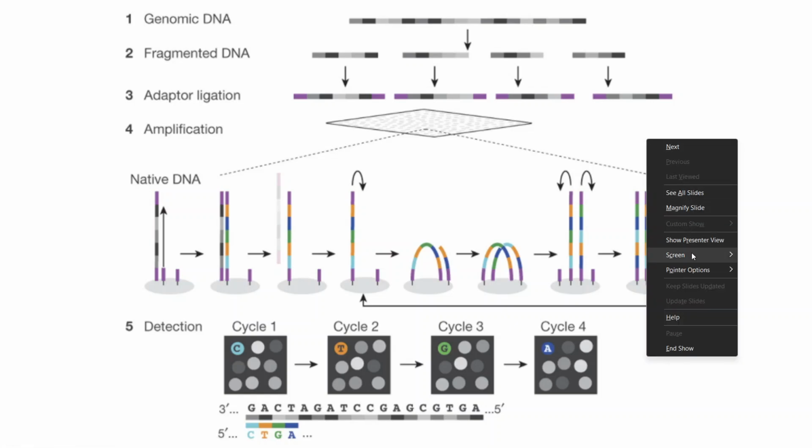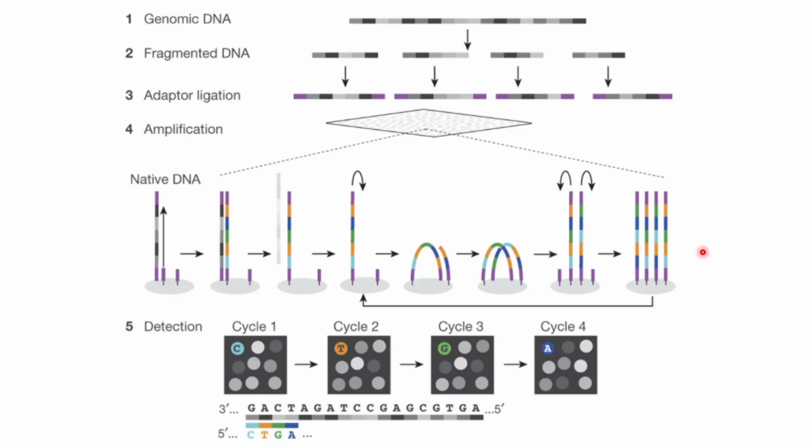As you all know, earlier sequencing was basically done with the help of Sanger sequencing, and next generation sequencing is done in the process of Illumina, and nowadays nanopore sequencing to completely read a whole genome is also being done. However, in this particular video, we will be discussing how sequencing platforms like Illumina work. Even nowadays, most of the time Illumina sequencing is one of the most commonly used sequencing platforms, especially in research work.